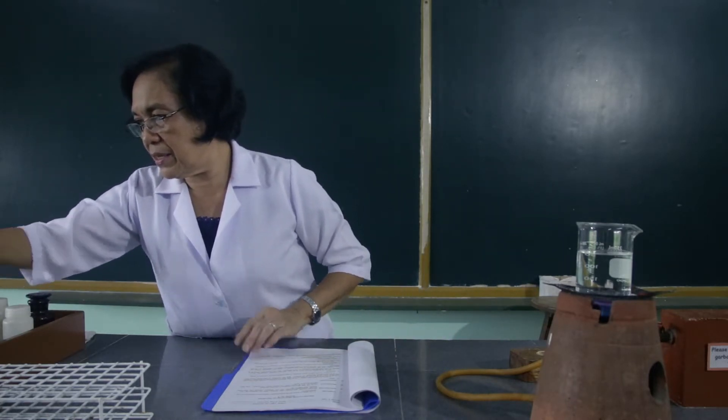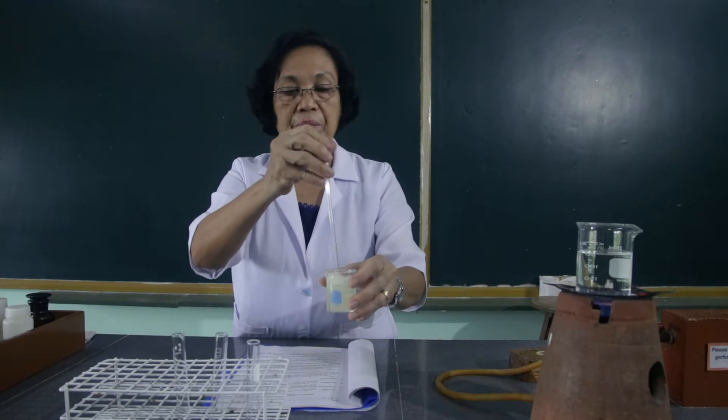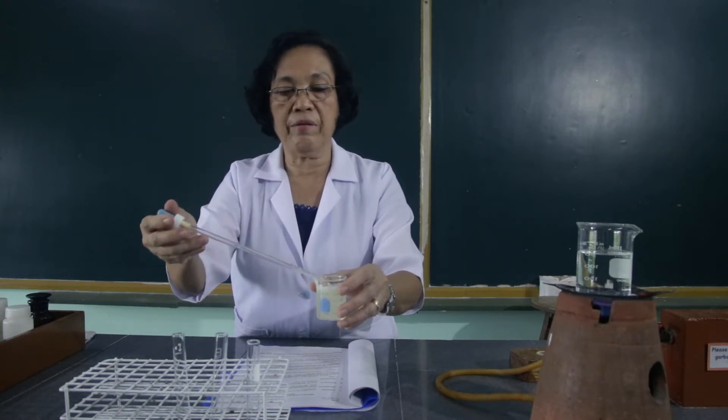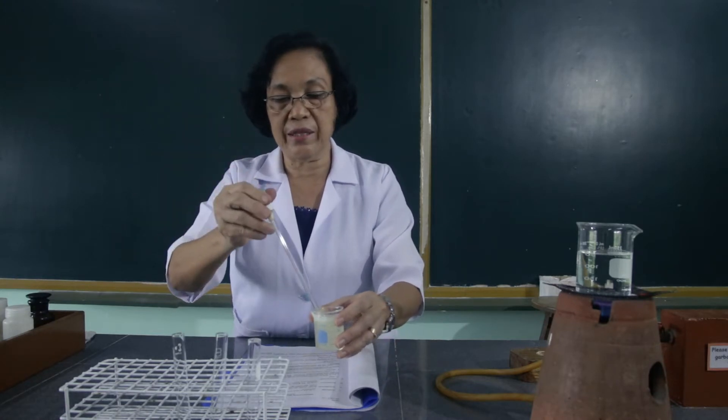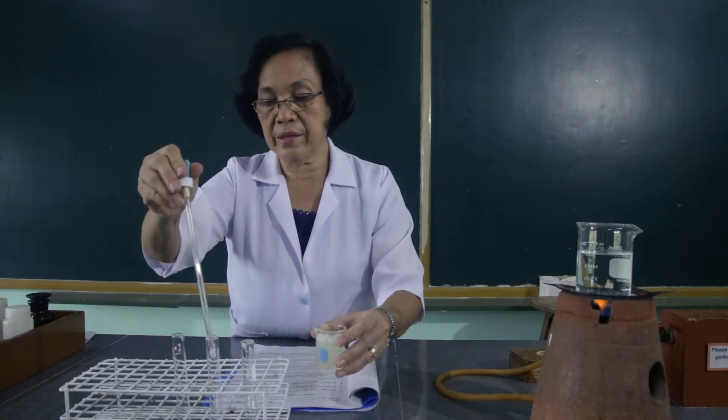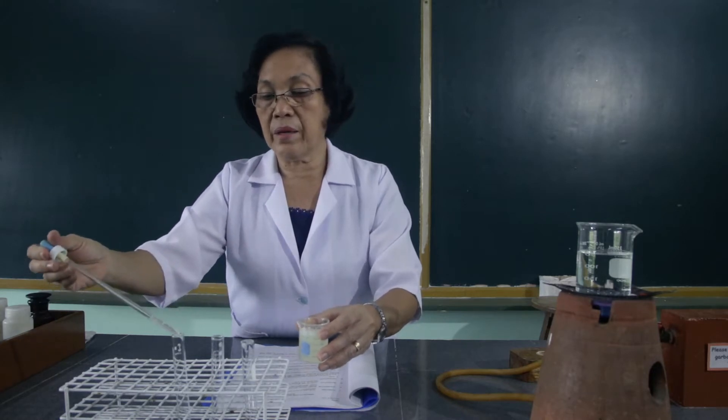For the first method of precipitating the protein, by heating, we will get three test tubes and fill each with 1 ml of the egg albumin. So this is the egg albumin. We are going to get 1 ml of the egg albumin and place this to the test tube. Then to the second test tube, we will fill this with egg albumin. And to the third test tube, fill this with 1 ml of the egg albumin.